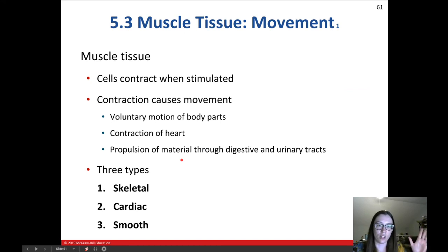All right, that concludes connective tissue. I know this is a lot of different tissues. This lab is probably one of the harder labs for everyone to wrap their minds around, but stay with me. We're almost done. We only have nervous and muscle tissue left. There's only 3 types of muscle tissue and 1 type of nervous tissue, so we're almost there. We're also going to be focusing on muscle tissue in chapter 10 and nervous tissue in chapter 12, so I'm going to keep this pretty brief. I do want you to be able to identify these types of tissues under the microscope, but you don't need to know all the details until we get to chapters 10 and 12.